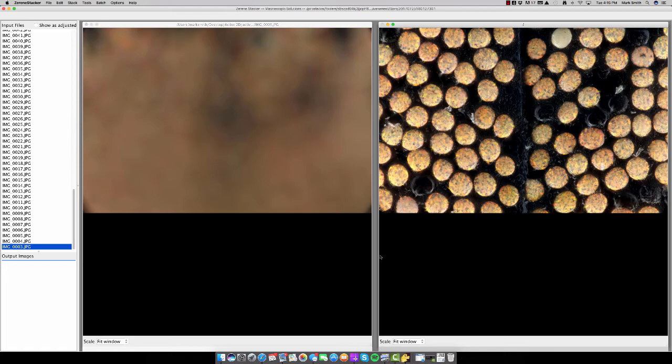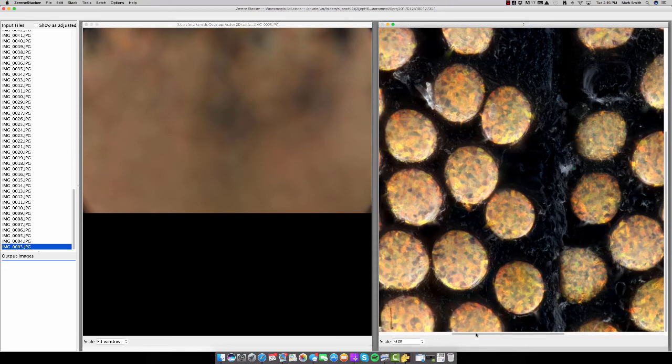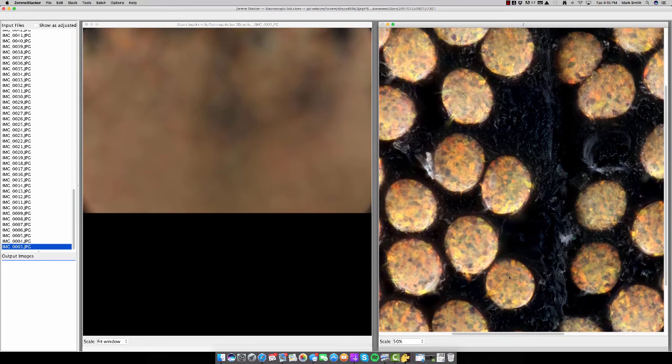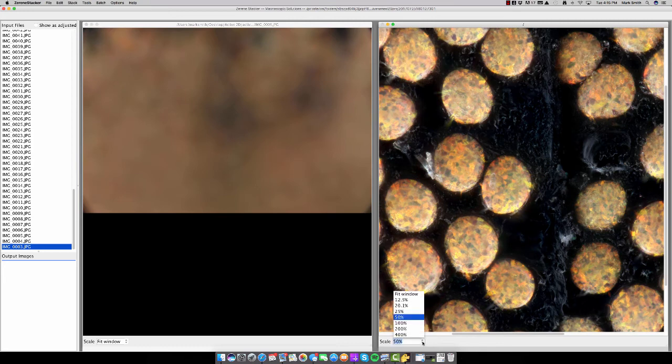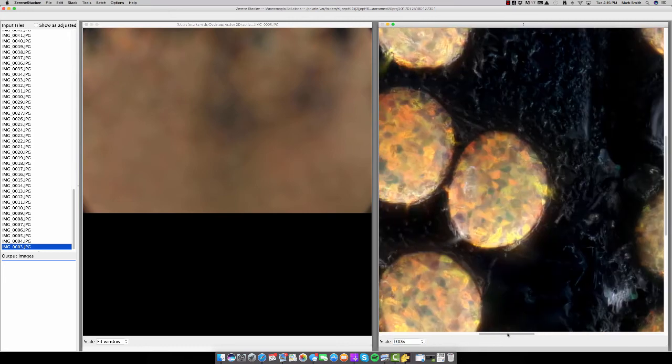What we'll do is we'll just take a look at the image. So we'll go to 50% first and you can see the quality is pretty good. There's really no noise. Basically the pixels are pretty smooth all throughout, which is pretty good. And there's a hundred percent at 50X.